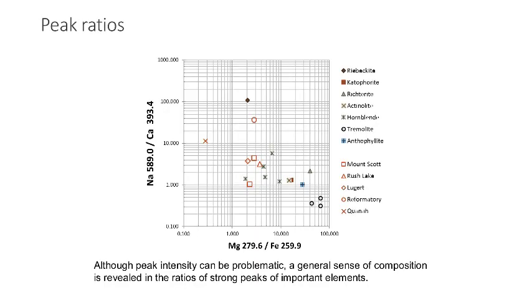A simple and straightforward means for discrimination is to evaluate the intensities of the peaks from the spectra, particularly to look at peaks that have some meaning for the minerals involved. For example, in amphiboles, sodium and calcium, magnesium and iron compete for similar sites within the structure. So looking at ratios of their intensities might give us clues to differences between the populations.